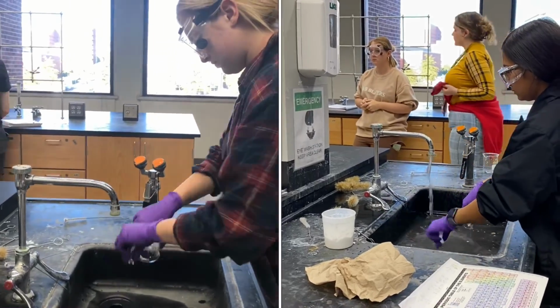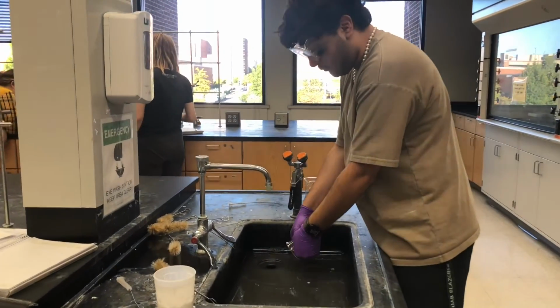Be sure to dispose of all solutions in the sink and clean your glassware as well as your corresponding lab area.